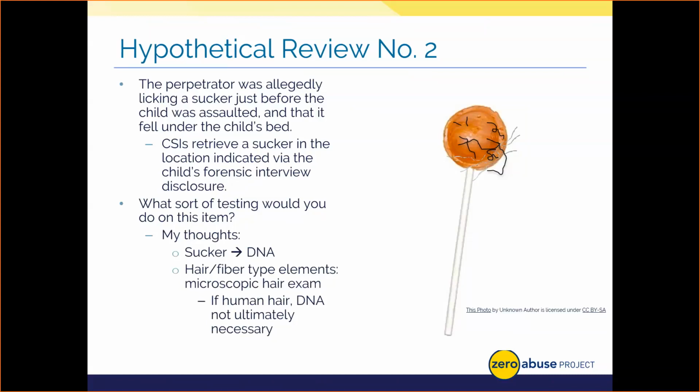Let's say that we do still send the suspect trace items on for testing. We confirm there's human hair present, but no root for DNA. Then we find out and confirm that the fibers from the sucker match the carpet, and the sucker is in the victim's room. But does it tell us anything new in addition to or more probative than the DNA from the sucker itself? Or more powerful information than the results from the previous hypothetical evidence involving possibly blood and semen, or maybe even that saliva?